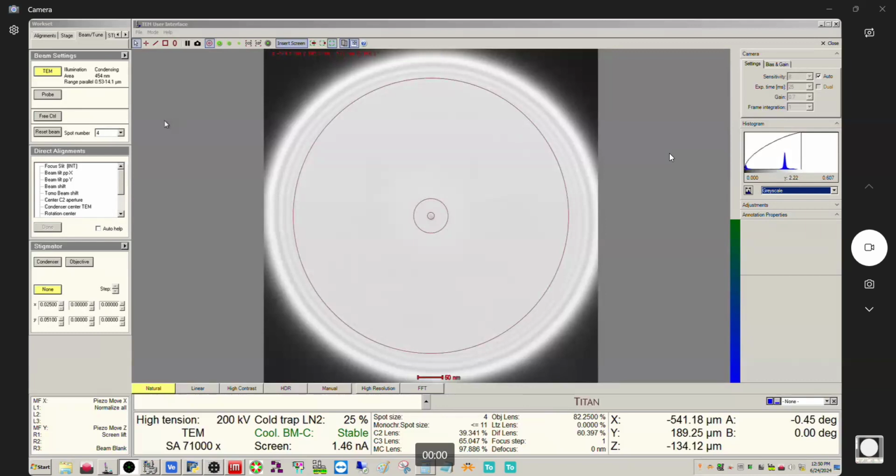If you have ever seen a comet streaking through the sky, or more specifically it's actually out in space and we see it as we view it through our atmosphere, you will notice that it has a tail behind it as it's traveling along. So this is where the name comes from: you're trying to remove the tail from the comet.